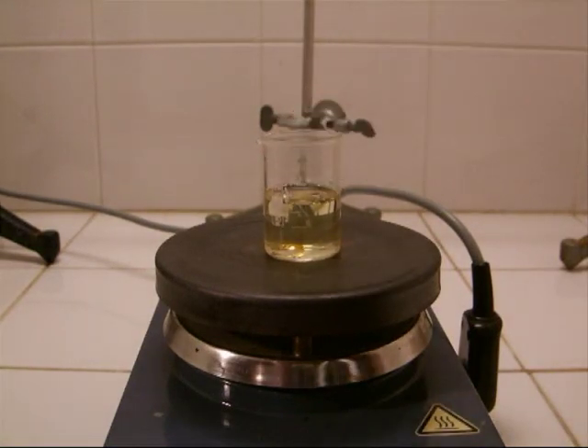Now I put a piece of gold into the mixture. Due to the low concentration of the nitric acid, the aqua regia must be heated a bit to become more reactive.